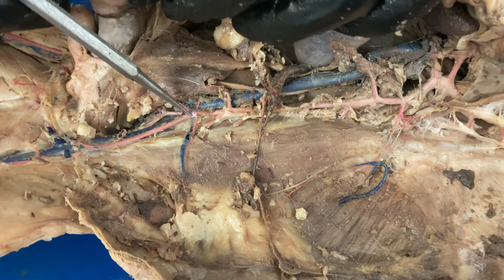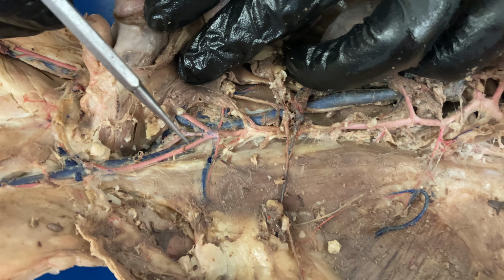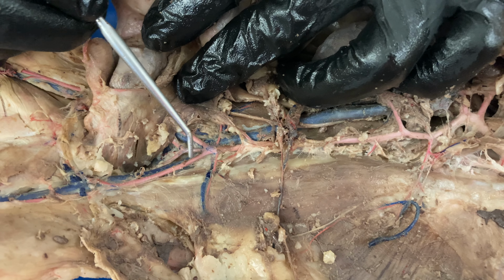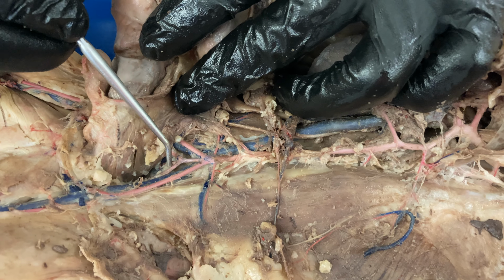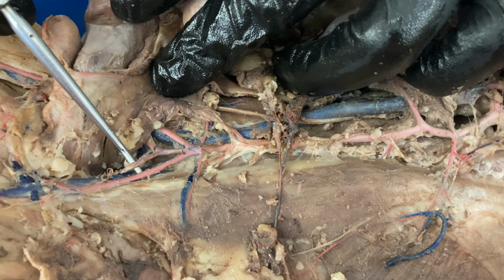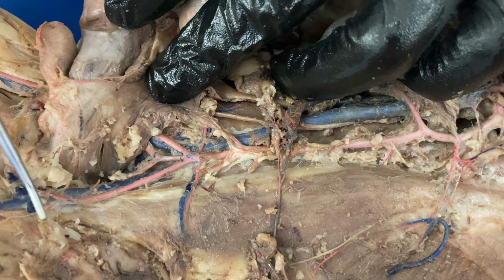At the end of the aorta, we're going to see a split. This is going to give rise to the iliac artery. So in cats, we don't have a common iliac artery. We only have an external iliac and an internal iliac. And again, don't forget your left and right. So this would be the left external iliac artery. This would be the left internal iliac artery. The iliac artery is going to continue right about here.